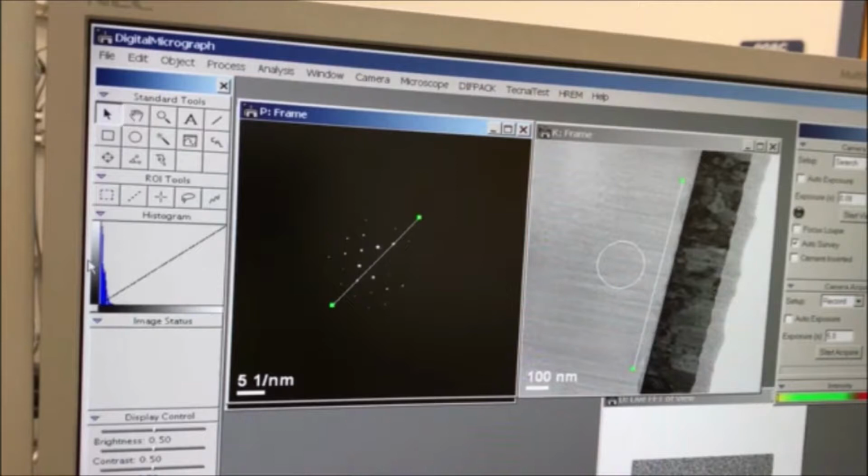So one of the things we saw in the demo on CBED was how we can reveal additional symmetry information of our material that we can't get with a selected area diffraction pattern. So if we're working, for example, with a crystal that doesn't have inversion symmetry or it has polarity, and we're collecting a CBED pattern from it, and we want to properly know the polarity with respect to the image, then we can't just pick one of those two rotation angles and have it be correct.